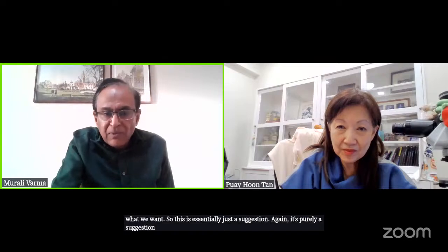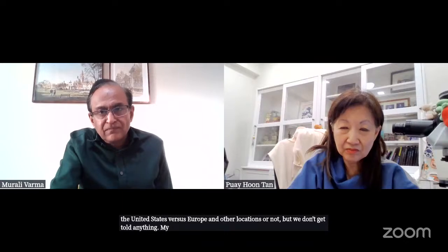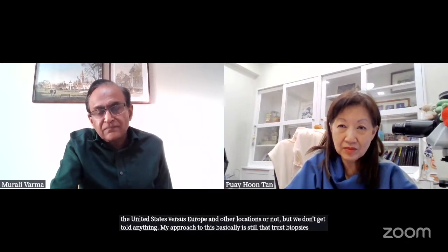Okay. So I can just say really briefly that we are told nothing by our urologists, and I don't know if it's the United States versus Europe and other locations or not, but we don't get told anything. My approach is that the standard of care for TRUS biopsies is 12.